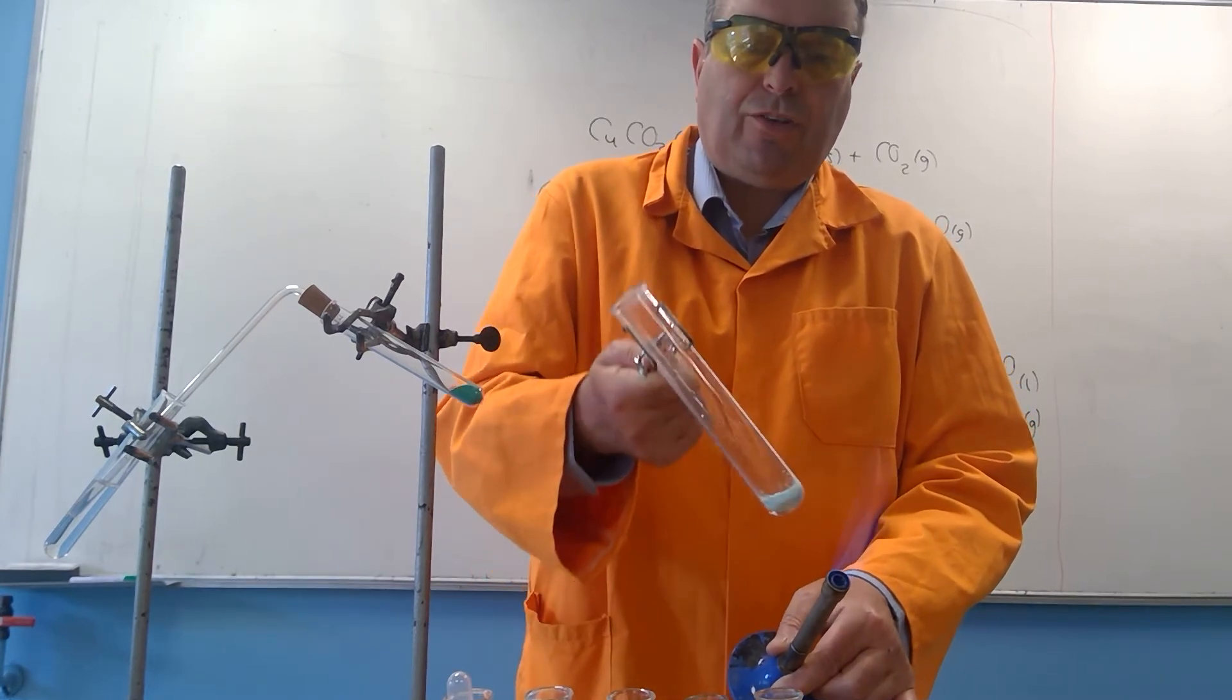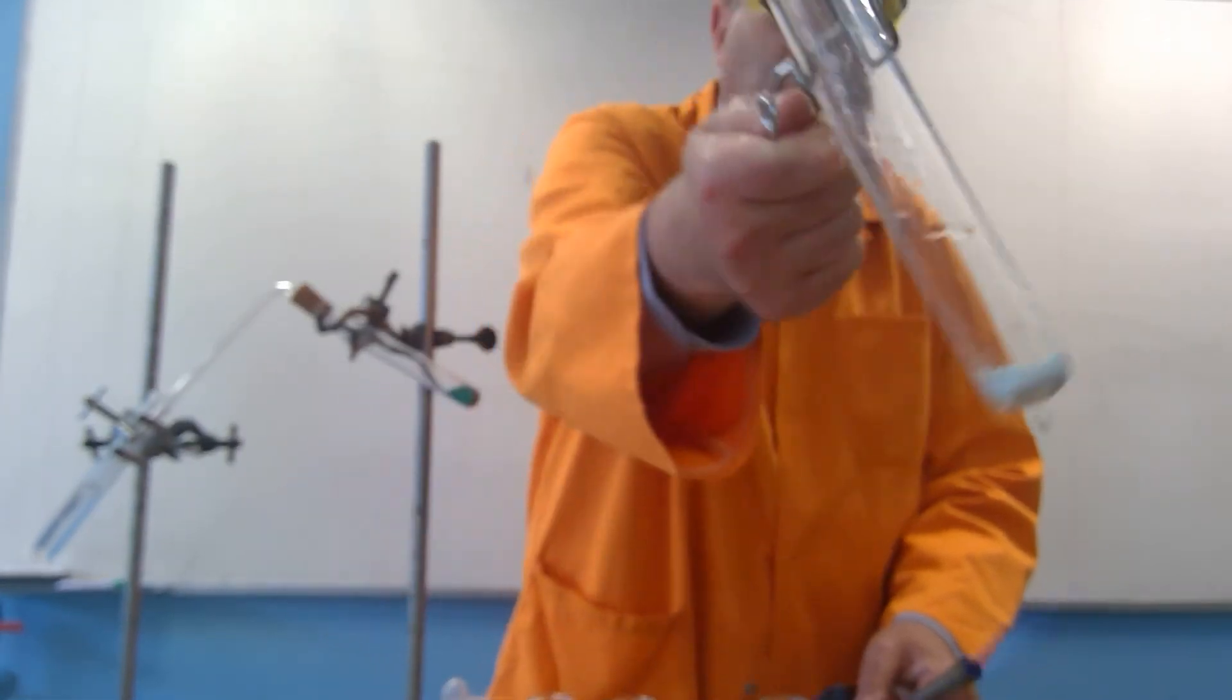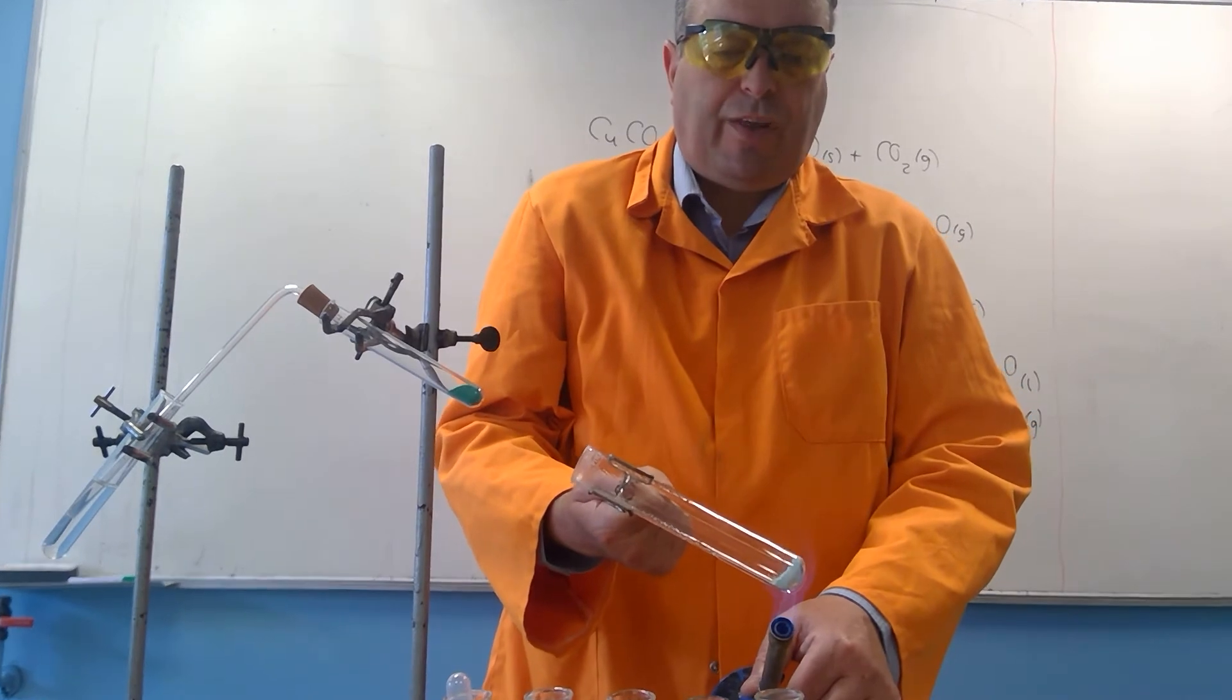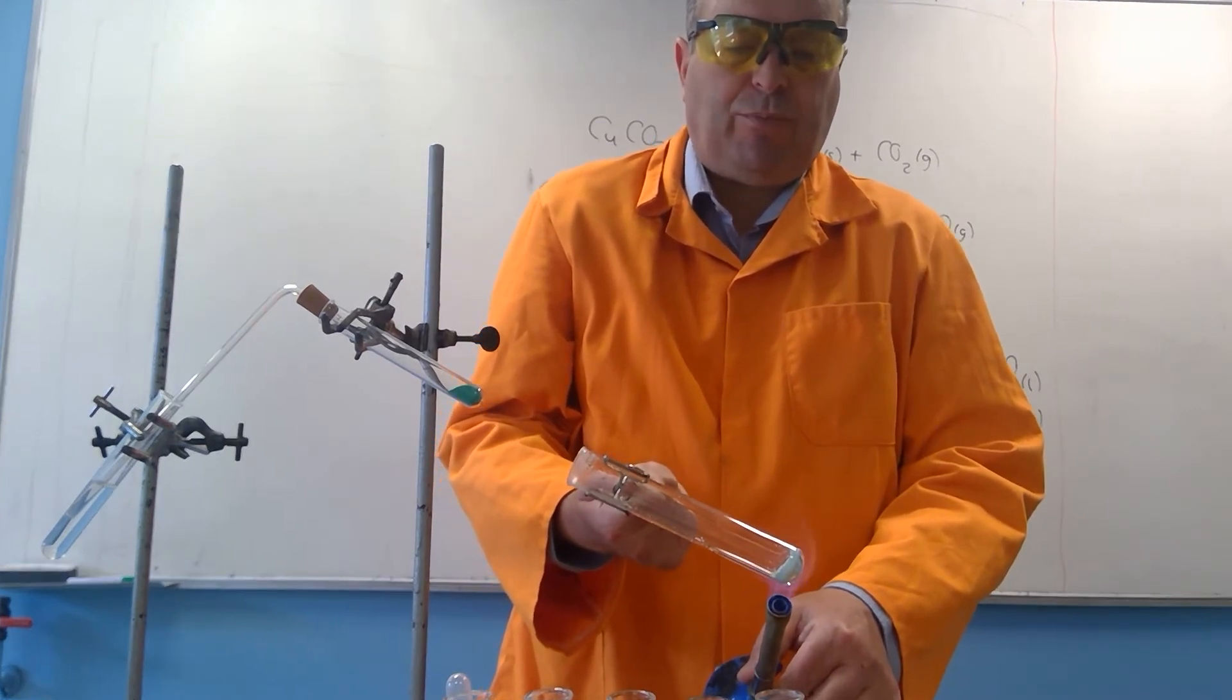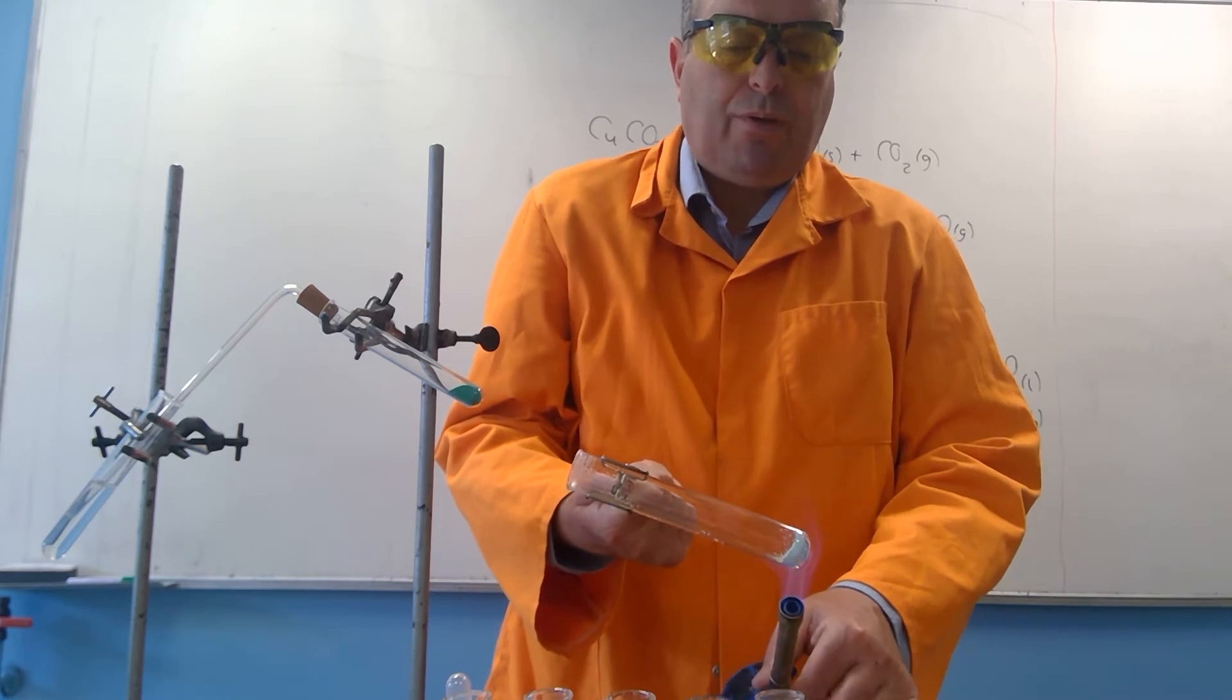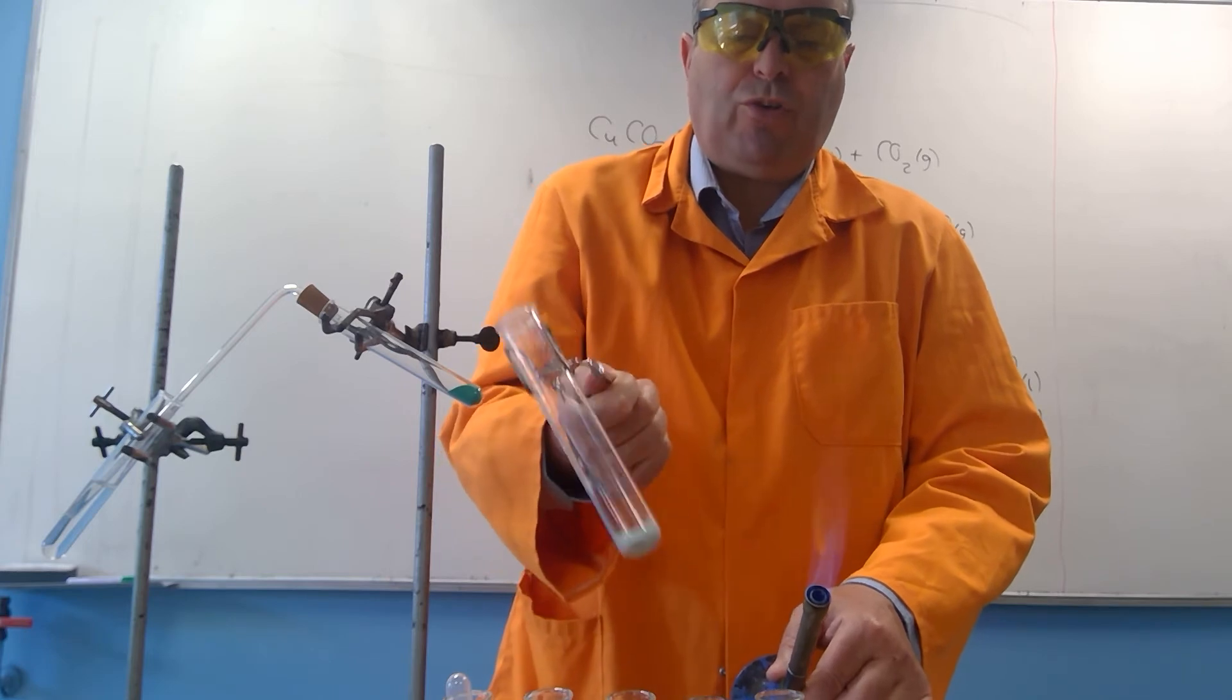Now you probably can't see it, so I'll go a little bit closer to the camera. There's condensation at the top of the tube—that's water. You can test for that by adding white anhydrous copper sulfate and it will go back to blue, or the blue cobalt chloride paper which goes pink in the presence of water.